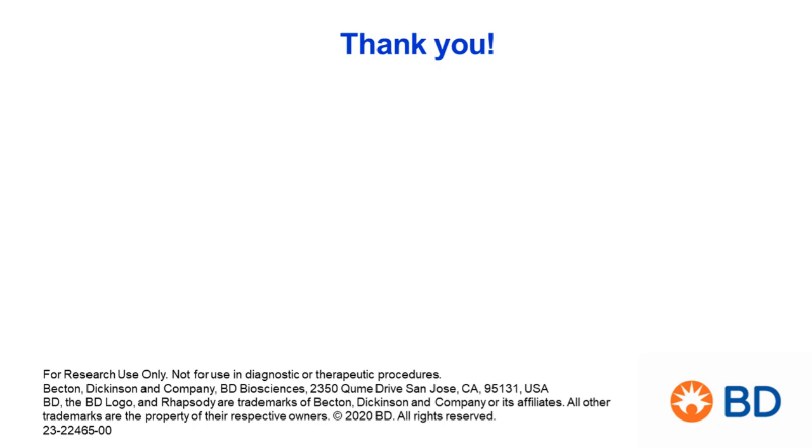Thank you. What is the lowest frequency of cells that may be detected by AbSeq, and can it be used for applications with rare events? That's another very interesting question. So rare cell types are something challenging to identify. You can definitely use this technology to identify them. However, if those cells are very rare, then there are alternative solutions.